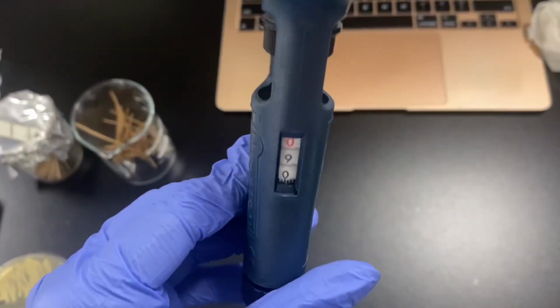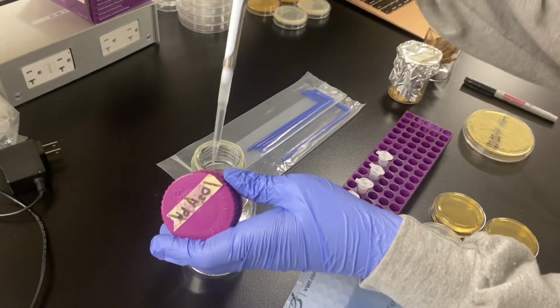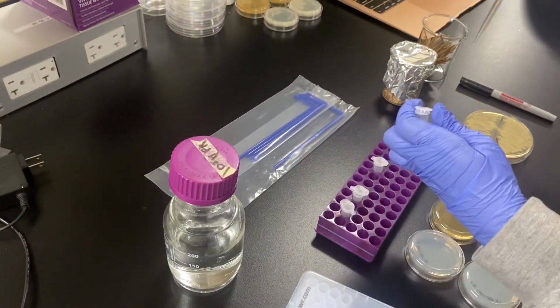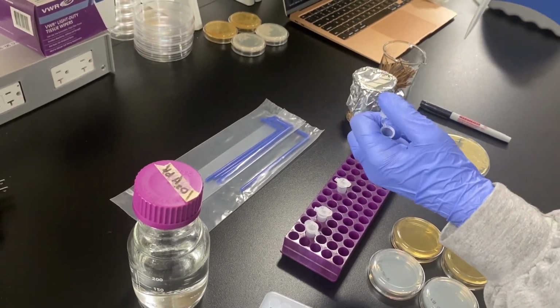Adjust the P1000 micropipette to 0.90. This will allow you to get 900 microliters of solution. Attach a fresh pipette tip and add 900 microliters of sterile water to tube number 3.